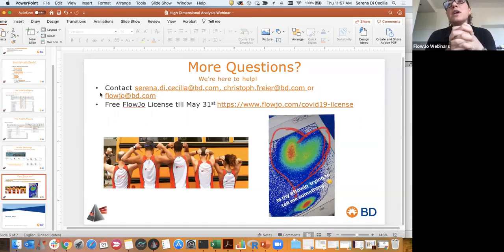You should have an idea of what you are looking for whenever you start an analysis, right? At least an idea of how your sample is made, or the treatment that you performed, or what you expect from your sample. It's the same thing as for the quality check plugins. There is not a best algorithm. It always depends on your need and your sample. You know your sample, you know how you performed your experiment, and you know better than us what you expect from it. So just try it out, guys. Have fun with this.